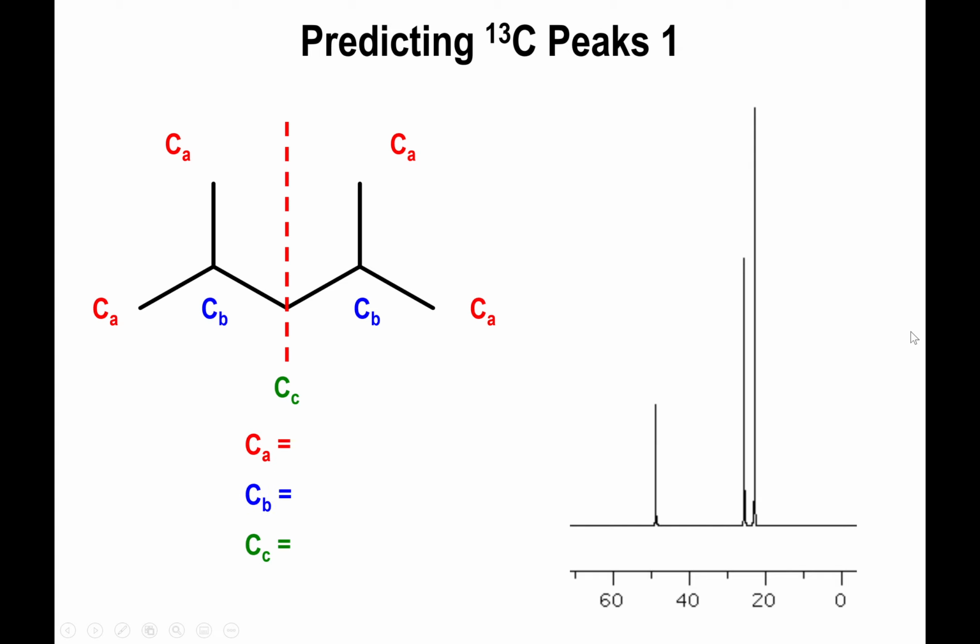And based on the oxidation state, we know that the carbon over here has 3 H's because it's a methyl group. So we know the oxidation state is 3 minus. The carbon over here has 1 H to complete its octet, so we have a 1 minus oxidation state. And the carbon down here has 2 H's with a 2 minus charge. So the one that is most oxidized is the blue carbon, or carbon B. So we expect that one to show up farther downfield.